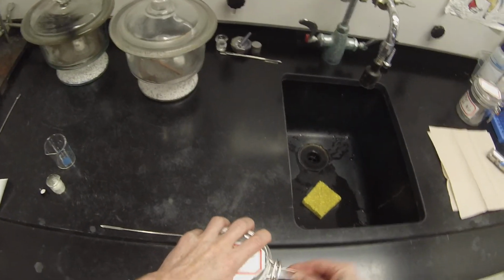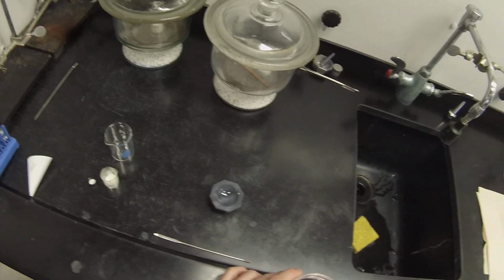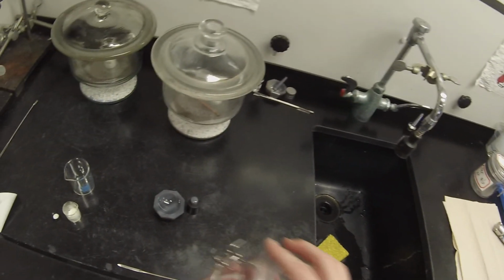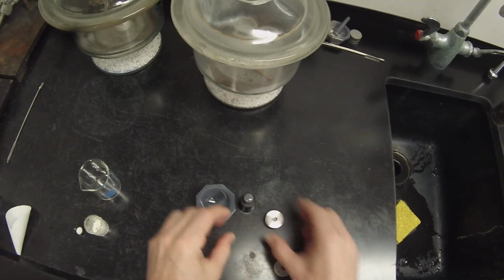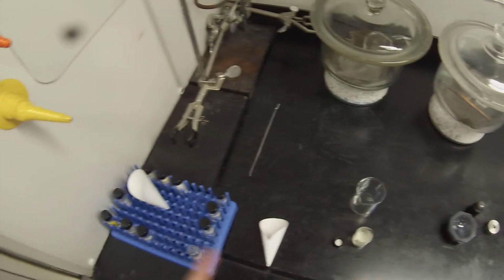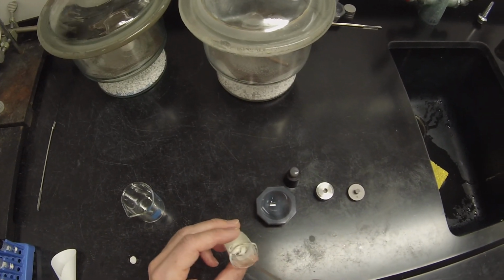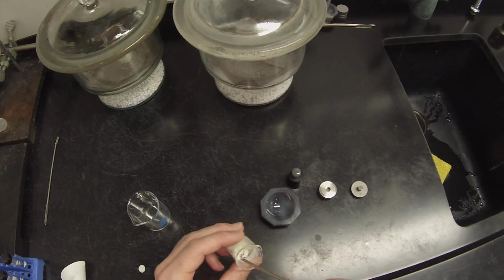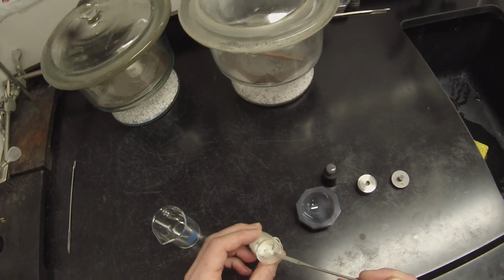So we're going to take an IR spectrum as well. I've got IR kit number 4 here for the KBr kit. So I can transfer a little bit of solid to the KBr kit. Put that collar on there. And then I want to put the rest of the solid in the vial for NMR and melting point later. So it's a kind of needly solid, so it's going to be a little difficult to get that transfer to go smoothly.